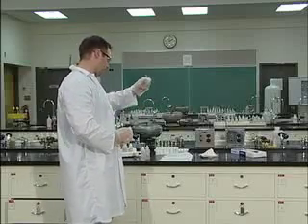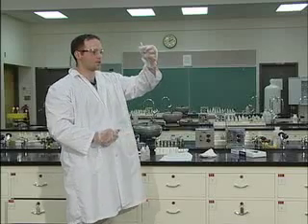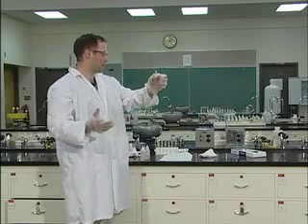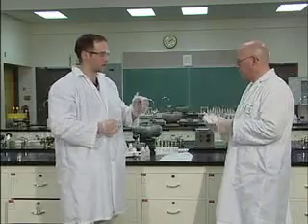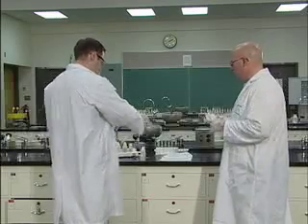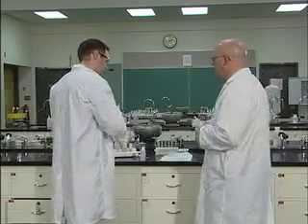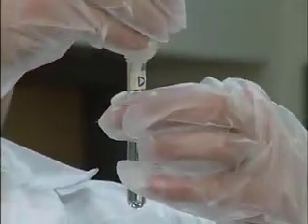Now, from there, you are going to record any changes that you note to happen. Now, this is not part of your lab, but do you think if I added barium nitrate back in again, that I could get the same reaction? Probably, sure. I would think so. Is that the end of our lab? This is the end of the lab, but I just wanted to end it with a sort of Christmassy look.